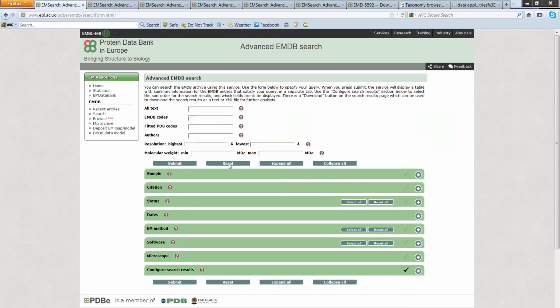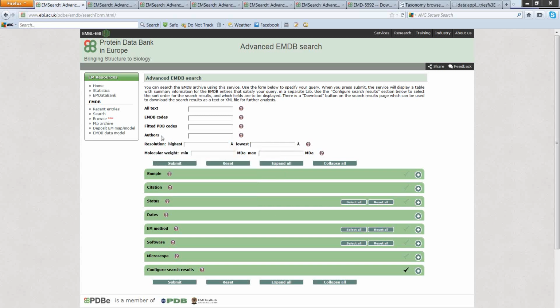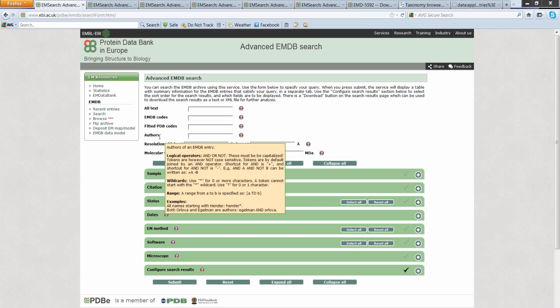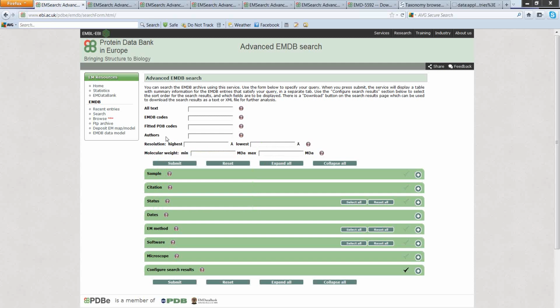So going back to the example of listening to Ronald Beckmann speaking at this meeting, what quite often happens when you hear people speaking at meetings and conferences is that you know the subject matter, but often with names you might have heard the name but you don't remember the exact spelling and so on. So we have implemented the authors field here so that rather than searching literally for authors' names, it matches based on sound, so it performs a phonetic search.